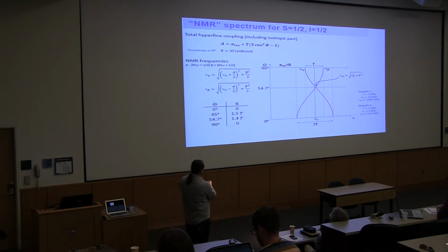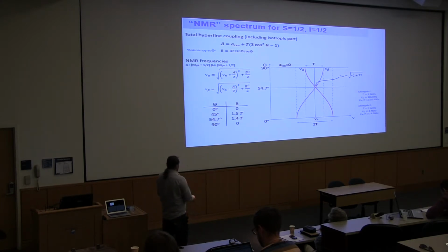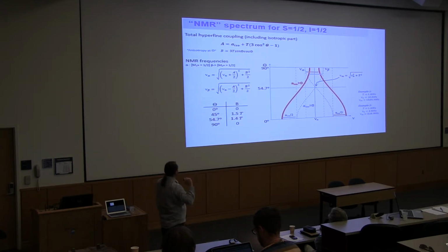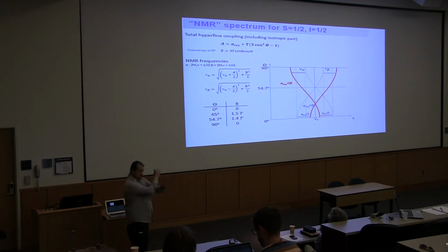So, and again, as you do an NMR measurement, you would see peaks that are spread by dipole coupling, then it will go to 0, and then again something spread by dipole coupling. That's with no isotropic coupling present. If you turn that on, things will shift around a bit. If it's a positive isotropic, they will shift one way. If you turn the other way, you'll shift it the other way, all right?